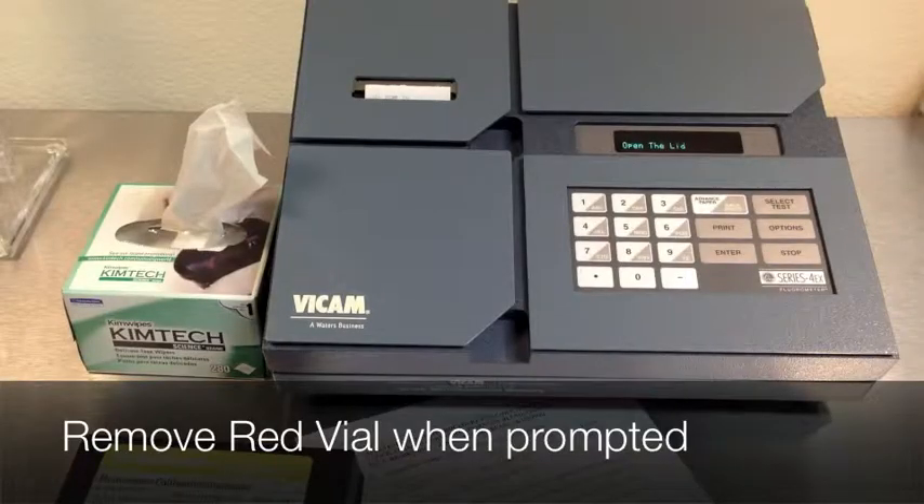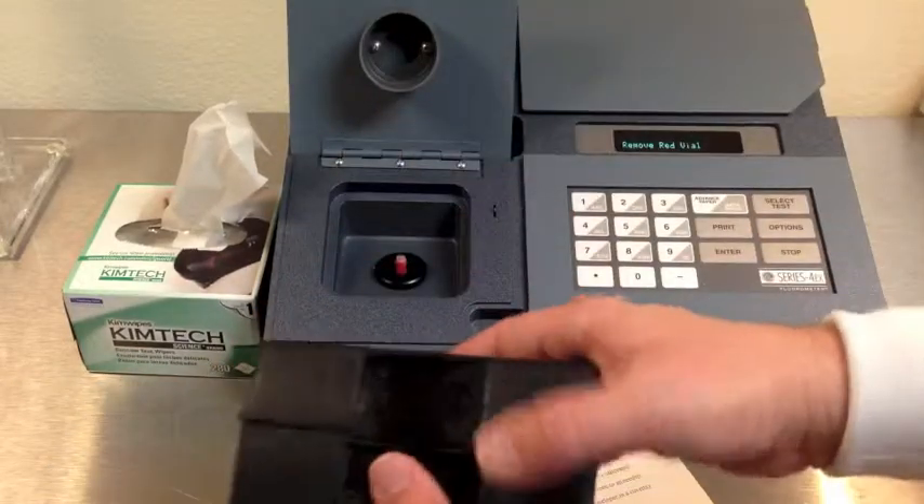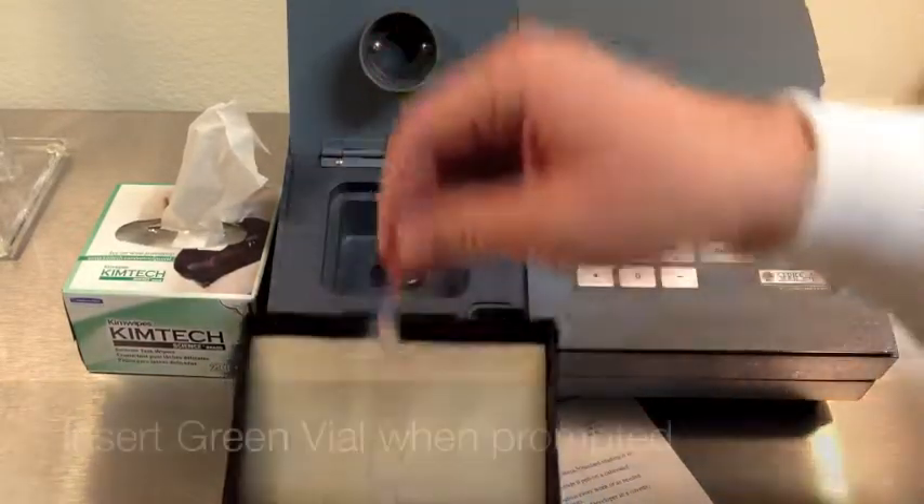When prompted, open the lid and remove the red vial. The machine will then ask you to insert the green vial.